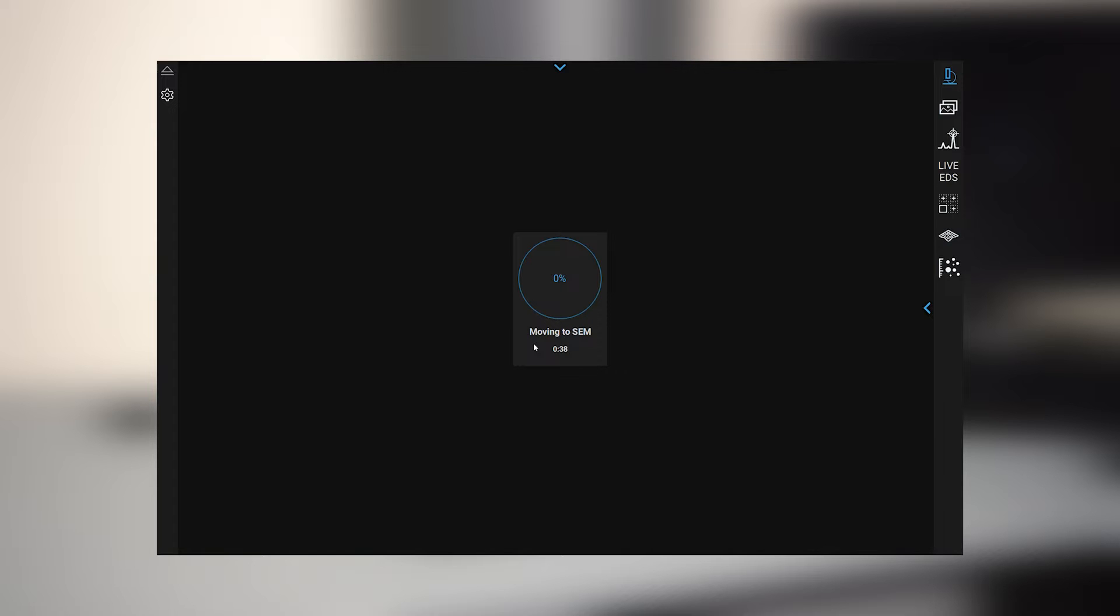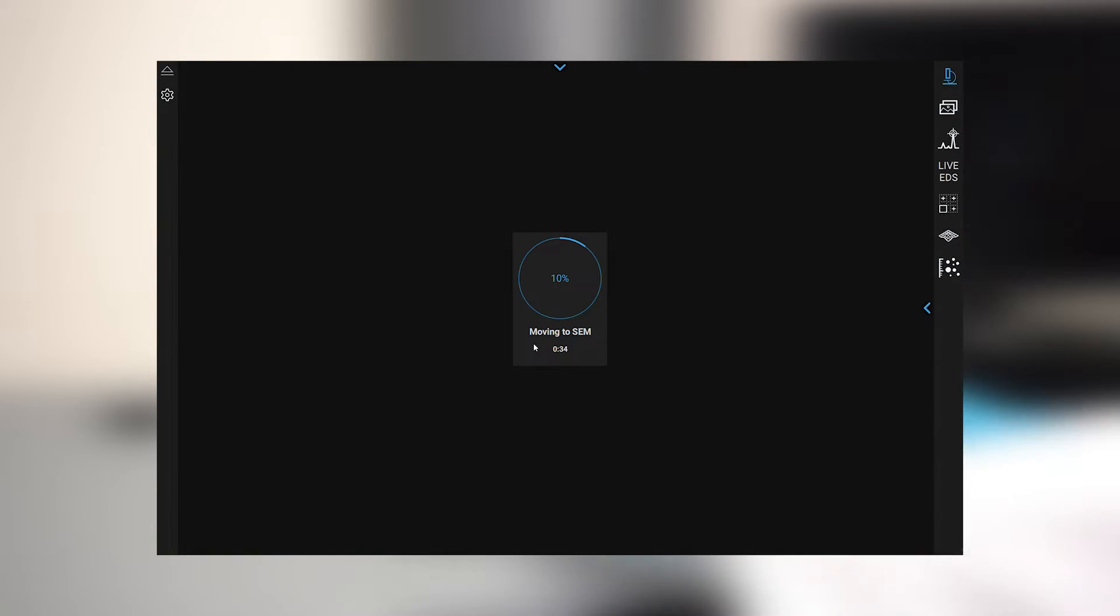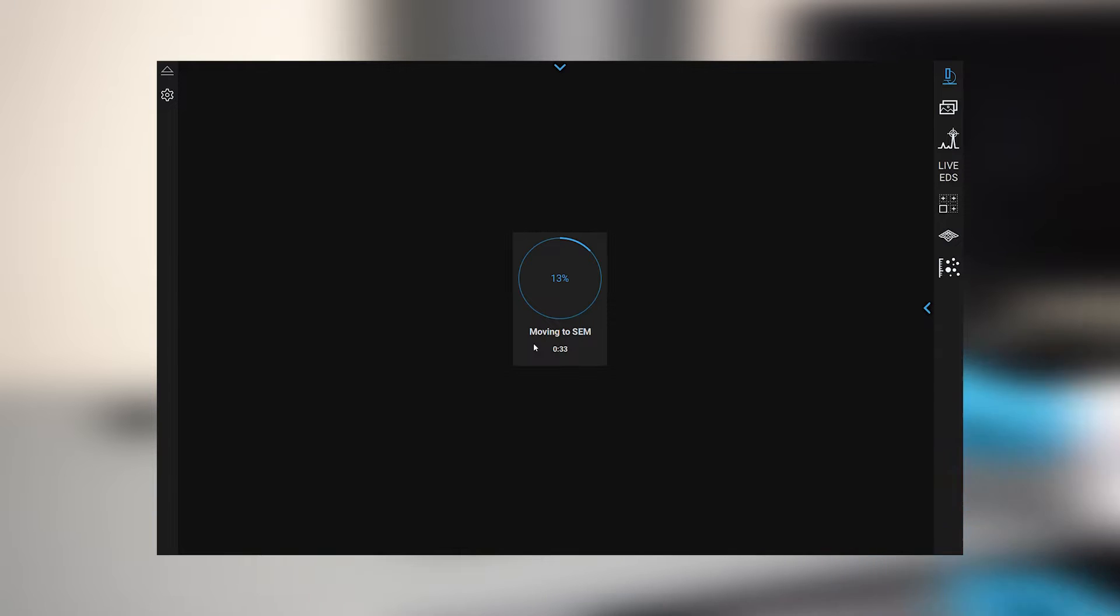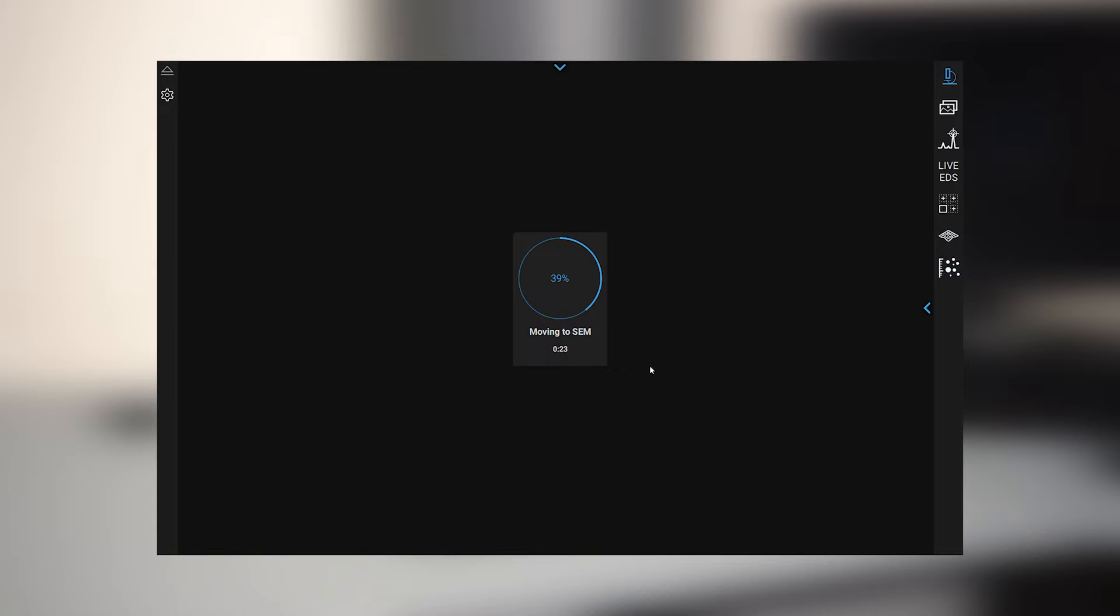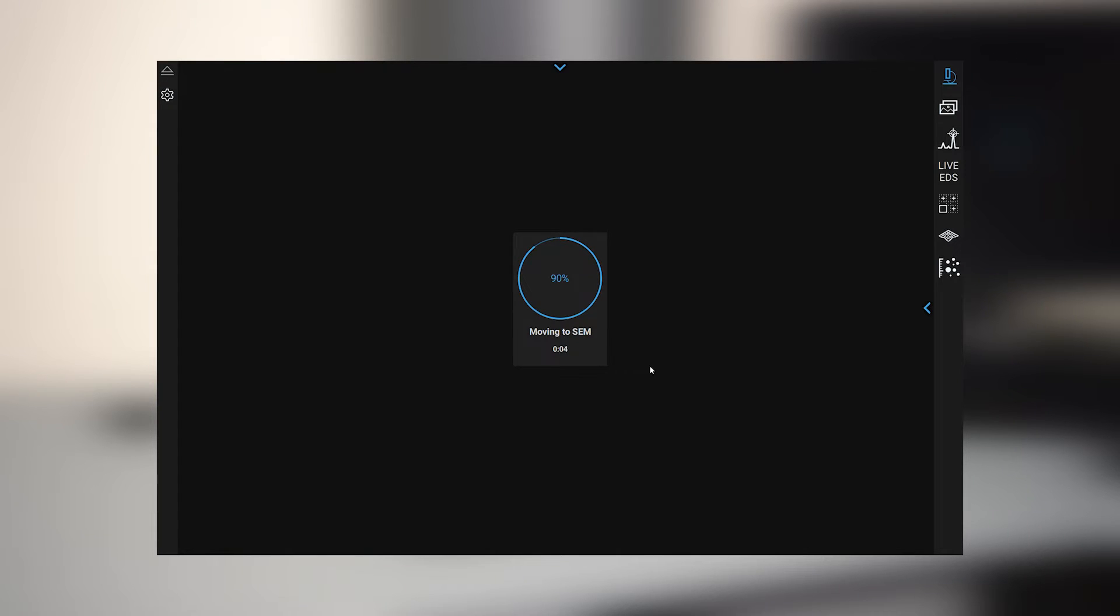And now it's automatically going to shuttle the sample underneath the electron column and begin a timer where the diaphragm pump will begin pumping down and help the turbo molecular pump inside the SEM to achieve a proper vacuum for SEM imaging. You can see how fast this is, so in less than 45 seconds I will have an SEM image on the screen.